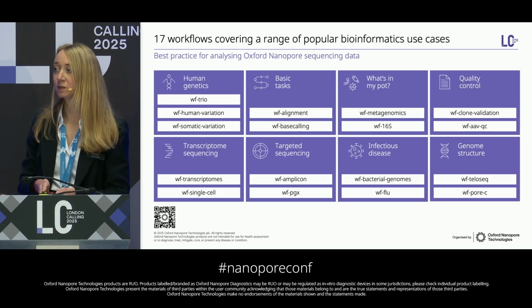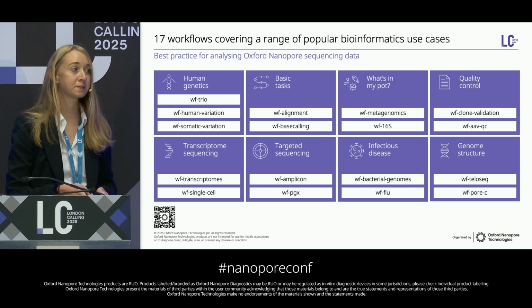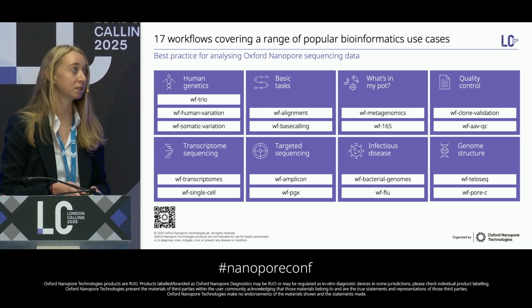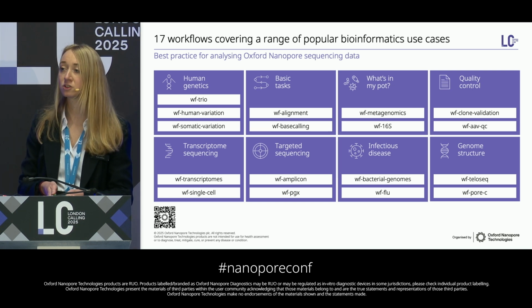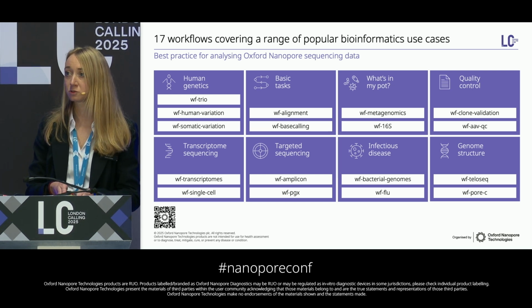We now have 17 workflows covering a range of popular bioinformatics use cases. These represent best practice for analyzing nanopore sequencing data and have been developed alongside internal benchmarking and tool development efforts, and we also work with external tool providers as well.